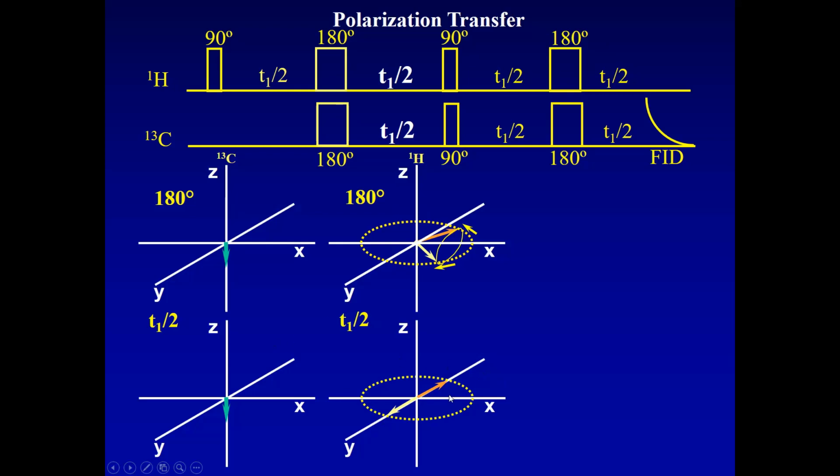If we were to open the receiver here, as long as we had sufficient spectral resolution, we'd see two peaks, one up and one down. And we wouldn't see anything in the carbon-13 side. And that may seem strange, to put the magnetization in a state where it's not very well detected. If the shimming's poor, if we don't have the resolution, the up and the down will cancel each other and we'll see nothing. But what's important to note is that by letting these, under the influence of the carbon-13, precess completely opposite to one another, we've maximized the evidence of their interaction.